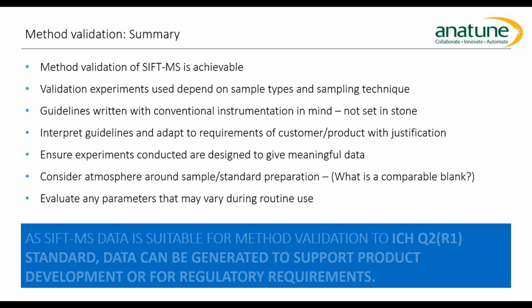You just have to make sure you're generating meaningful data that proves the system works. And sort of the last thing to say is, as a gas phase analyzer, you've got to be wary of the atmosphere around your system, because there is gas all around us. We breathe it every day. So we just have to be careful of blanks in this situation. But nonetheless, this has generated a method that has been validated to ICH guidelines that could be used for a regulated pharmaceutical application.